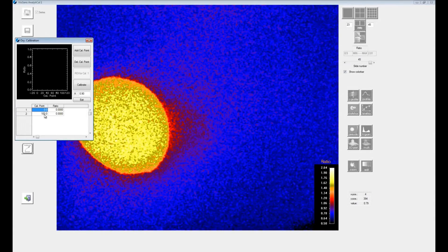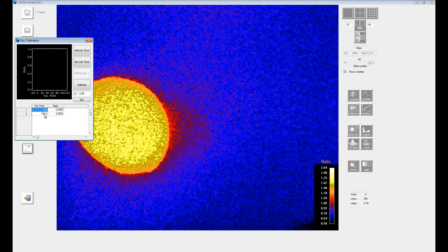It is recommended to perform calibration with at least three calibration points. You can add or delete a calibration point using these two buttons.